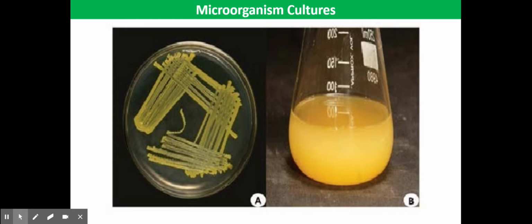Microorganisms will grow on almost any material that provides the carbon compounds for respiration and a source of nitrogen for protein synthesis. However, in the laboratory, microorganisms are usually grown in one of two types of growth media. The first is a set jelly-like substance called agar, which is melted and poured into Petri dishes. Typically, nutrient agar contains peptones, yeast extract, salts, and water, and might also contain glucose or blood. The second is a soup-like liquid called a broth, which is kept in bottles or tubes.